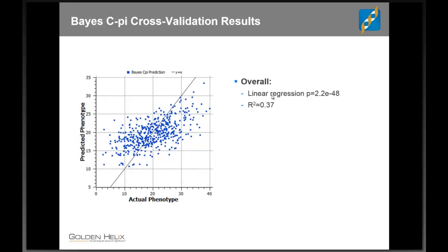But if you stratify this and look at each of the 5 subsets, and especially that one that had the good convergence, that one with the strong convergence here is in red, you'll notice that out here in the extreme values that I mentioned can be hard to predict, they're actually looking much better, both at the high and low ends. And the overall performance within that subset, R squared of 71%, much, much better than what we saw generally across the whole thing.